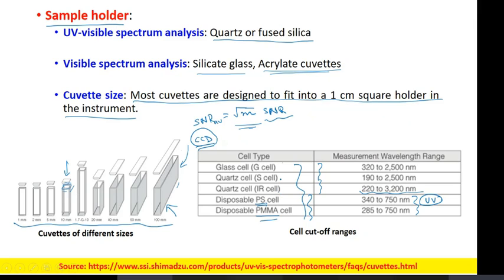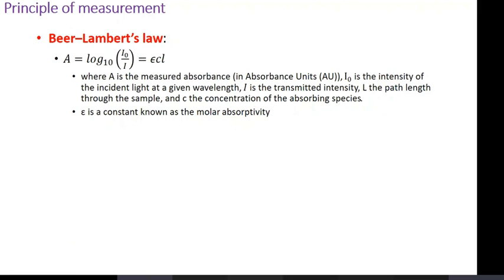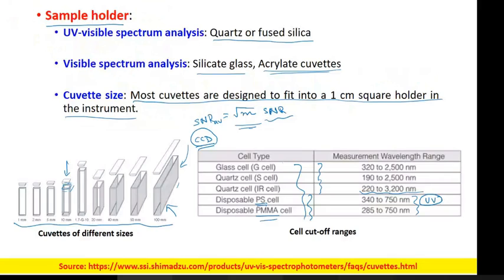Sir, is it essential to have one surface of this cuvette opaque or something? Because in the genetic engineering lab video, I saw that thing. Okay, you are asking why two surfaces?